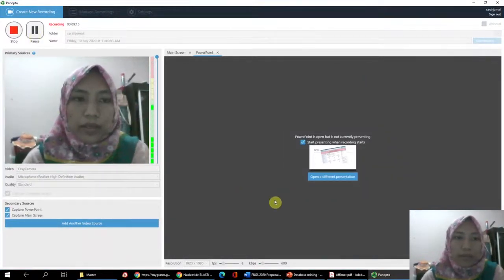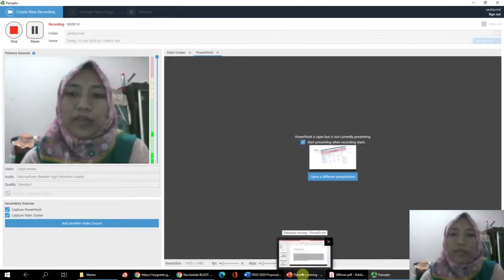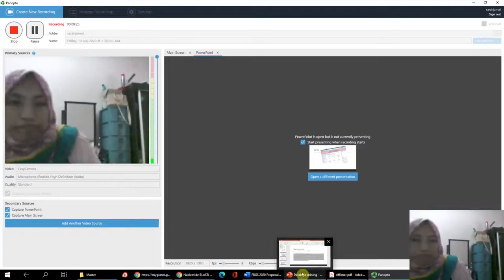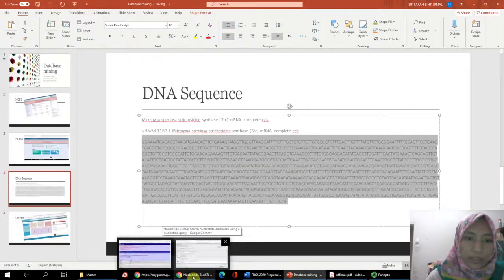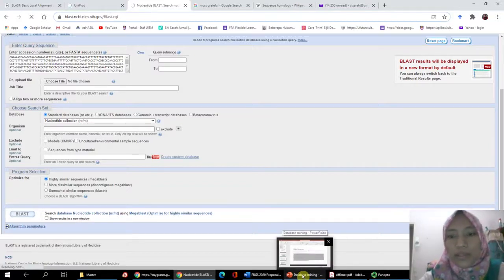Okay, if you are using some other sequence, because that was really similar, they probably couldn't find others that are a little different. So let's move on. If you have another sequence that you want to find, like this one, we had about 100%. That means it's identical. It's the same thing.